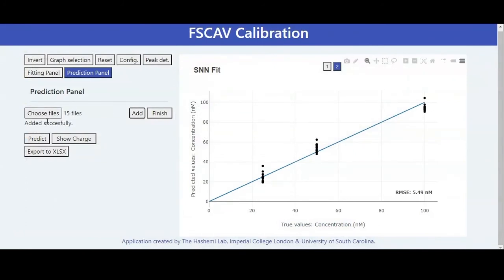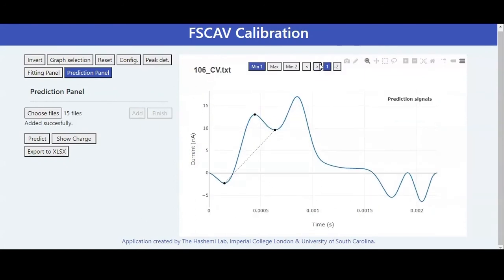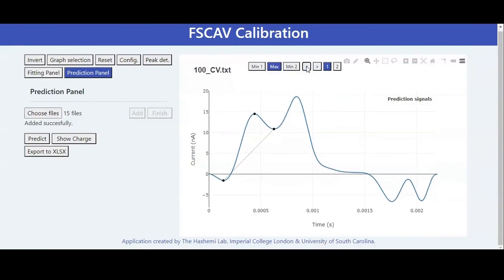One important thing is that the software in this case will sort the files by name. So be sure that they're sorted properly in your directory before uploading them. That is because when getting the predictions, the predictions are going to be dependent on time, and you'll probably want them sorted so they don't mess up in the application. A good way to do this is by giving them a numeric value, or basically their name being a number or the particular time at which it was taken.